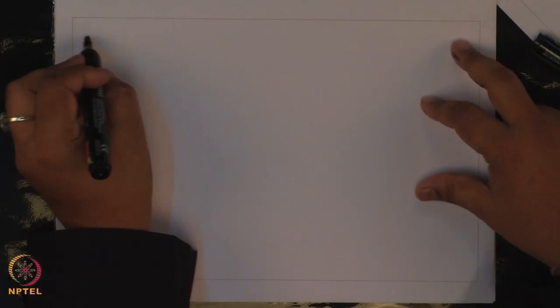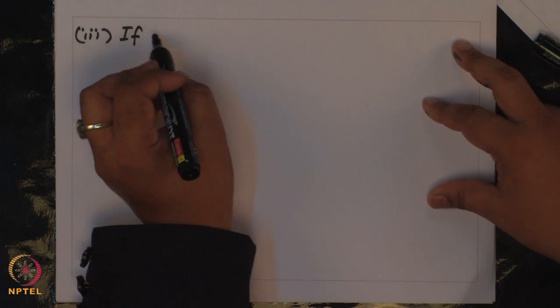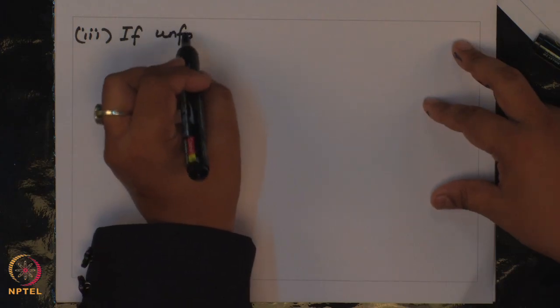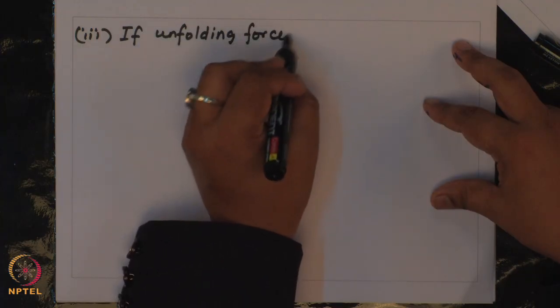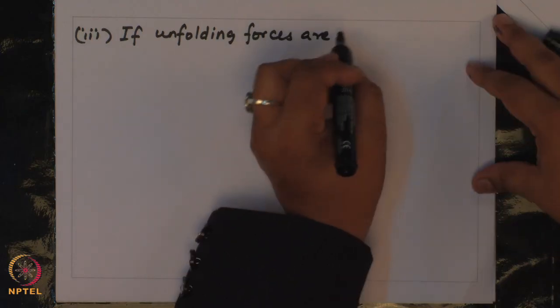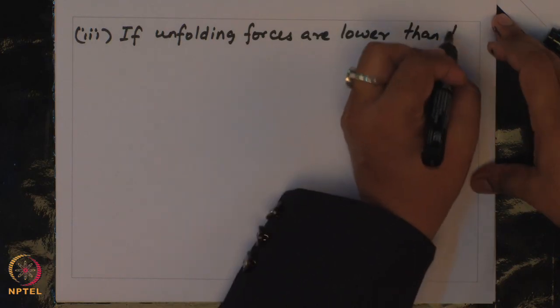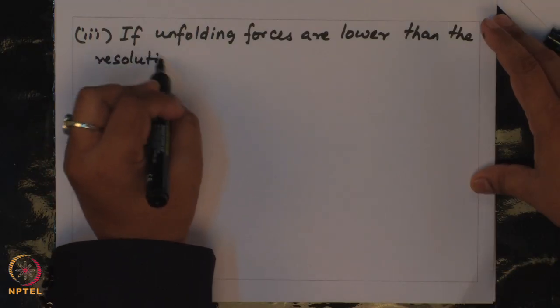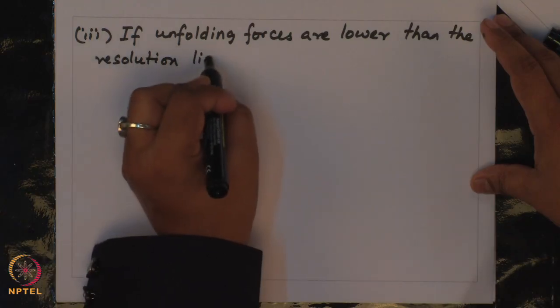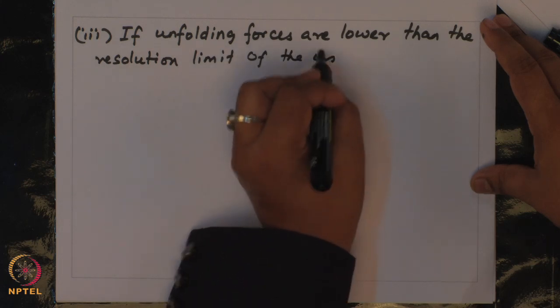There is another situation. If unfolding forces are lower than the resolution limit of the instrument.